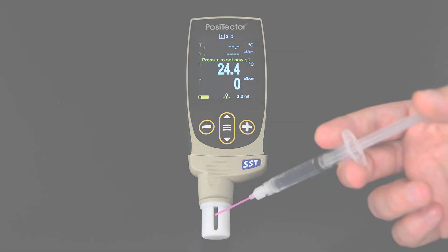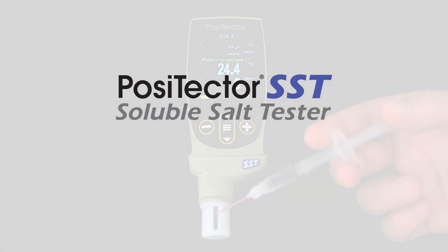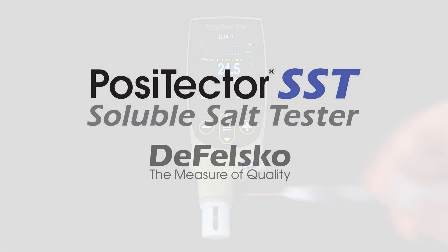How to measure salt contamination with the PosiTector SST Soluble Salt Tester by DeFelsko. The measure of quality.